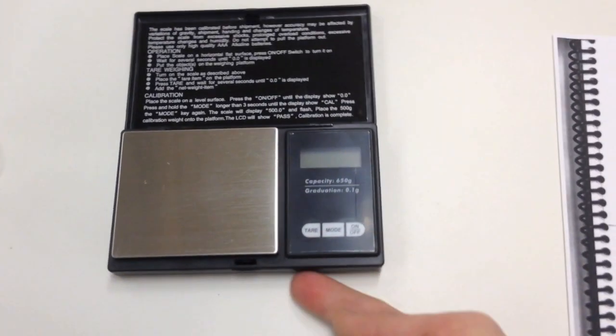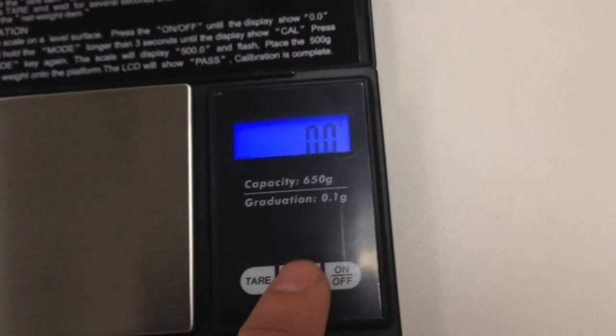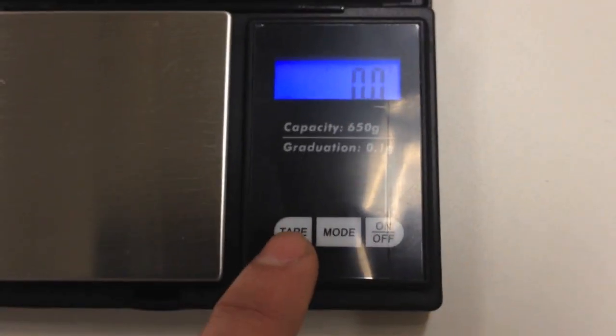You've got a scale like this. Remember there's a little red plastic thing in the battery case underneath — take that off so it'll work. Press on-off and it will light up; it's calibrating itself and should read 0.0. Make sure it reads grams — look for that little G in the corner. If it doesn't read grams, press mode to switch between ounces and grams. If it's not at 0.0, hit tare to zero the scale.